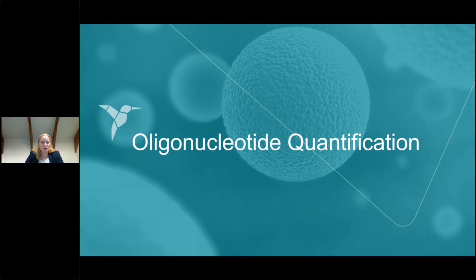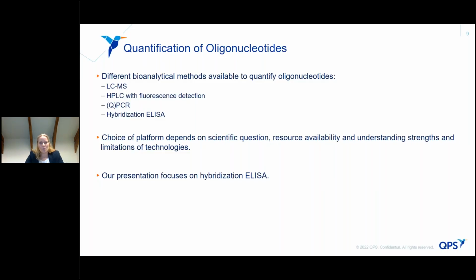So I want to tell you something about oligonucleotide quantification. There are different bioanalytical methods available to quantify oligonucleotides. This is, for example, the LC-MS method, liquid chromatography mass spectrometry, but also HPLC with fluorescence detection, the qPCR, and the hybridization ELISA. Traditionally, hybridization ELISA is used to analyze the large molecules from bioanalytical matrices, and LC-MS for the small molecules. However, recent advances in instrumentation and sample preparation techniques have propelled LC-MS as a complementary method, and it is being used for the bioanalysis of oligonucleotides as well.